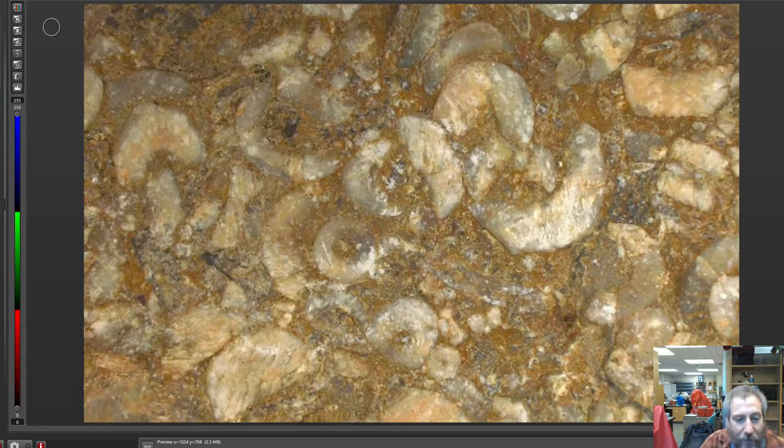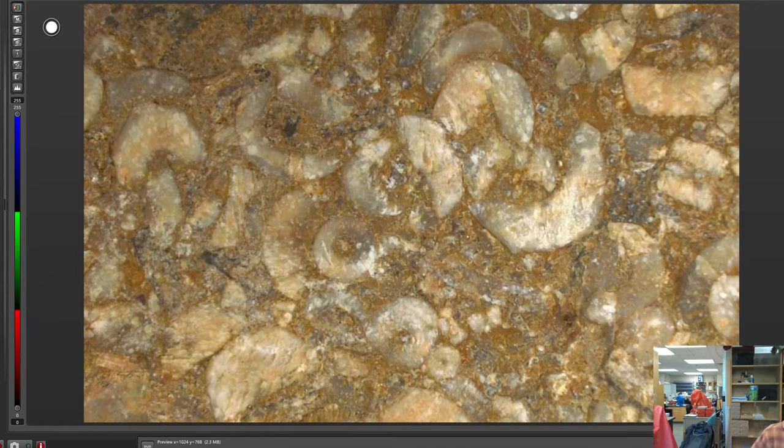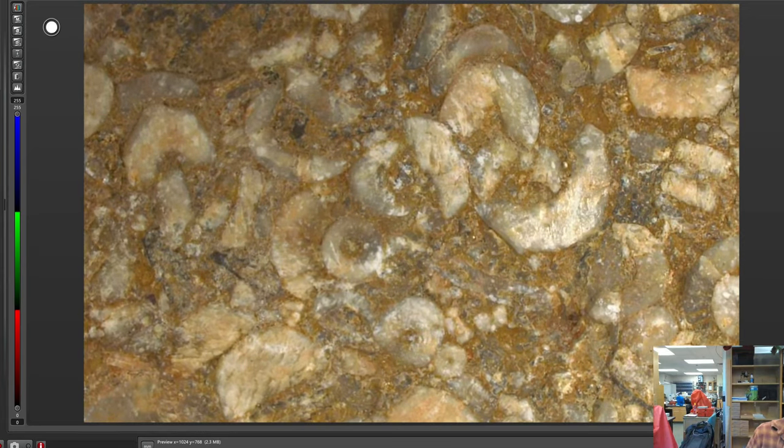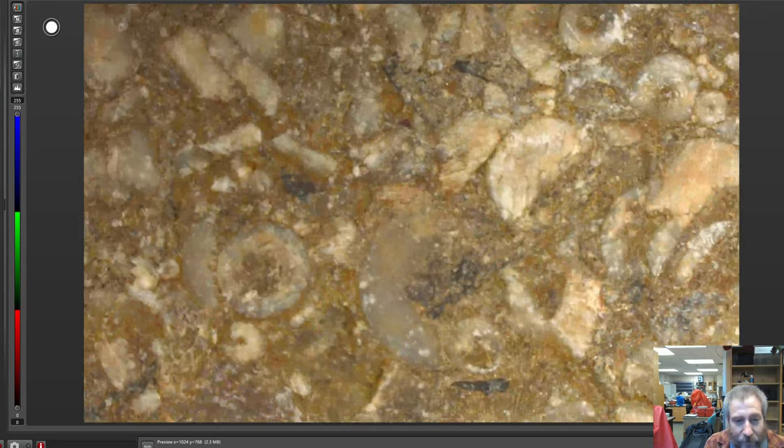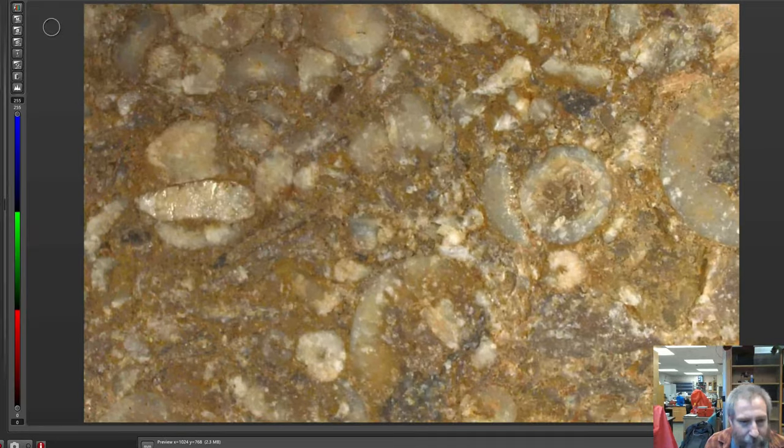So crinoids in the modern world, people recognize them. Around here, people call them Indian beads or something like that. But in the modern world, they're sea lilies. They look like a plant, basically. They're not a vascular plant, but when they die, they sort of disaggregate into these little tiny Cheerio-shaped things that we have in the microscope right now. People sometimes will use them as jewelry, and the fossils themselves are pretty interesting. Sometimes you can get a whole series of them stay together and kind of land in place.